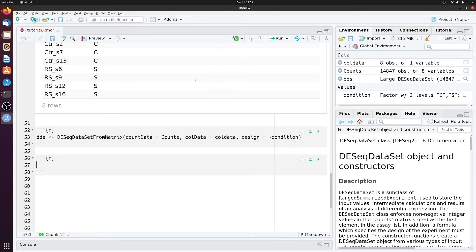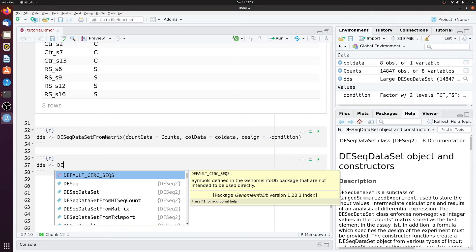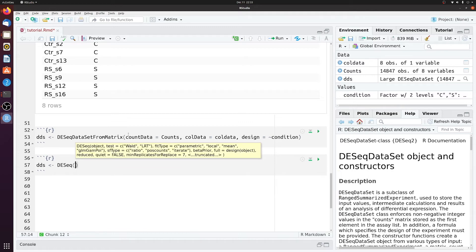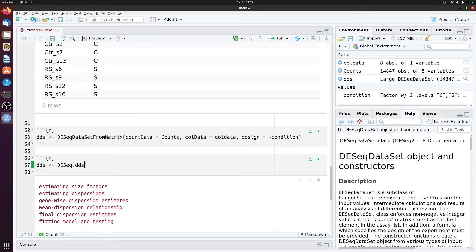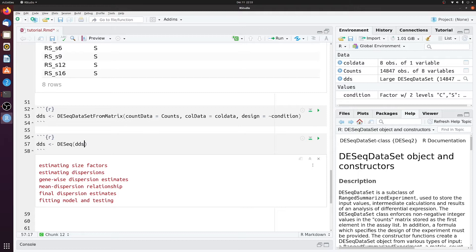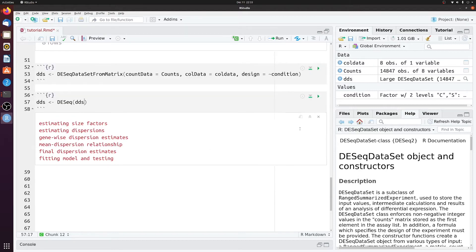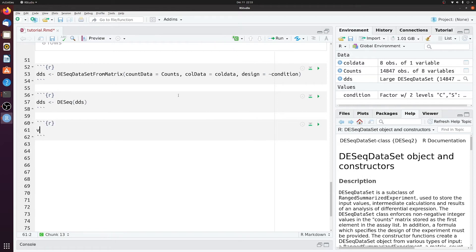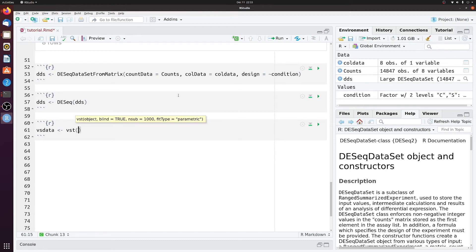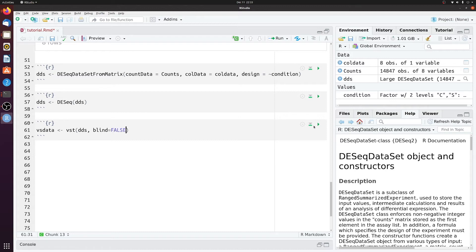Then we'll run DESeq on dds. This will take a second. We can just clear that. And then we also want to create a new variable called vsdata. And that will be vst of dds blind equals false. Alright.